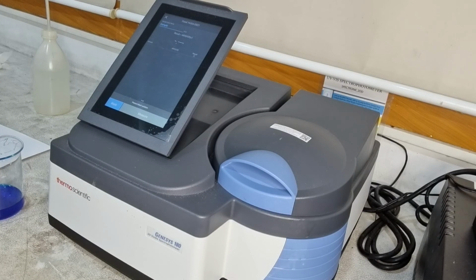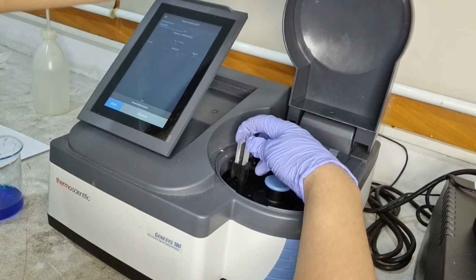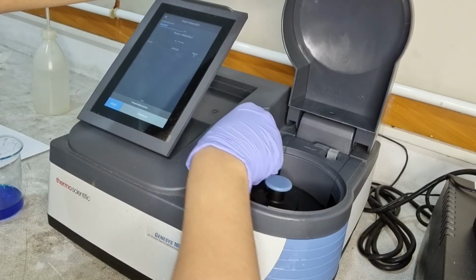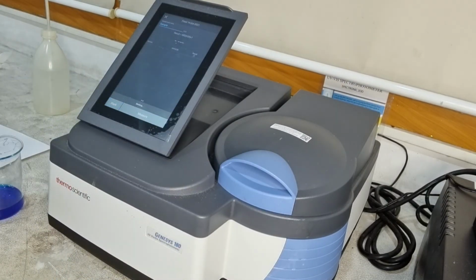I hope you were able to gain a good overview of how a UV visible analysis would work in a laboratory. As long as an analyte absorbs in the UV or visible region allowed by a spectrometer, you can construct calibration curves and calculate for the concentration of unknown samples.